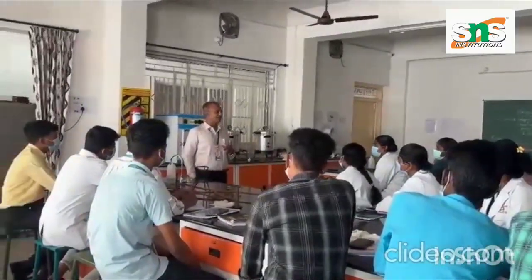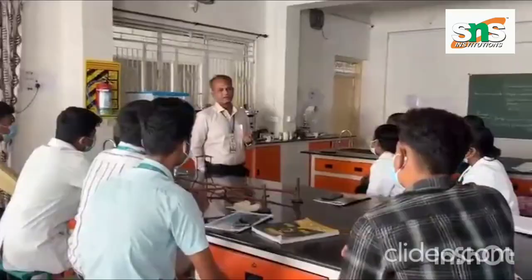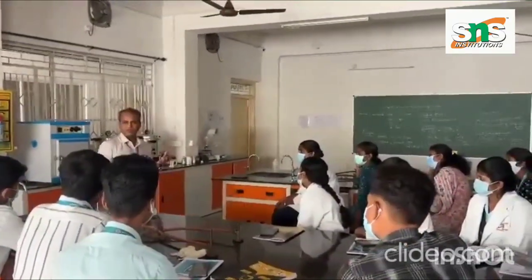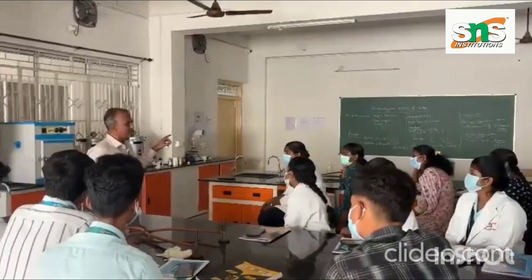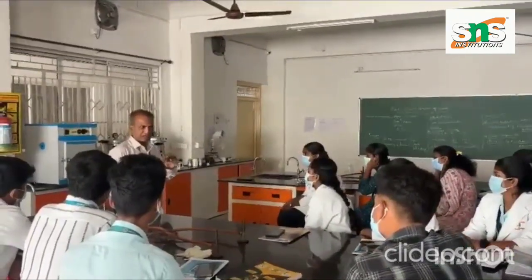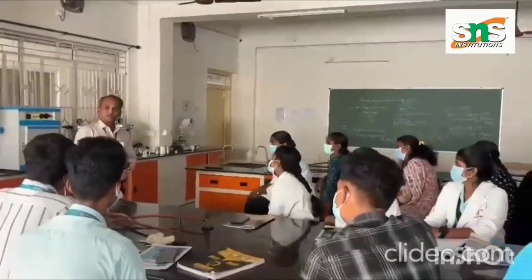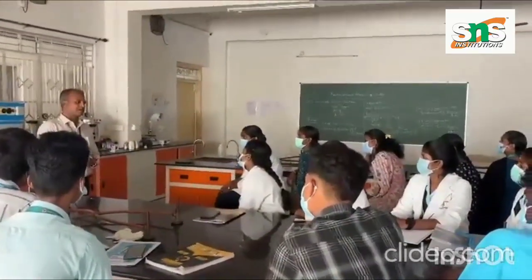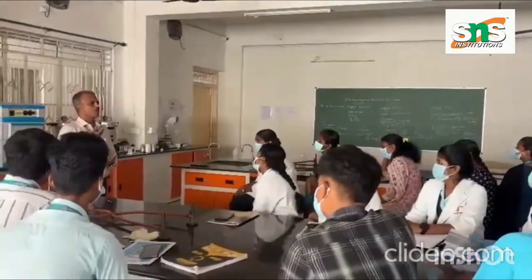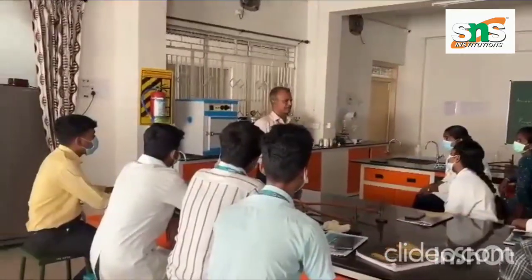Gas production or acidity indicates that the food or water source might be contaminated by E. coli or coliform bacteria. If the bacteria are coliform, they will ferment the sugar inside our digestive system, thereby producing more gas bubbles as well as acid.